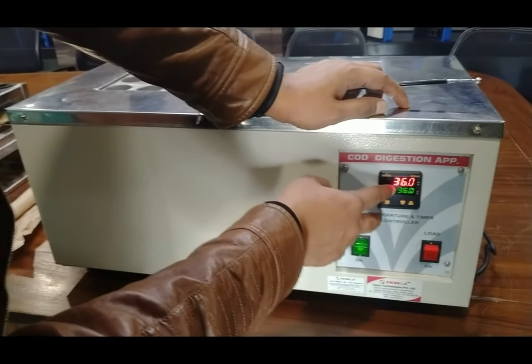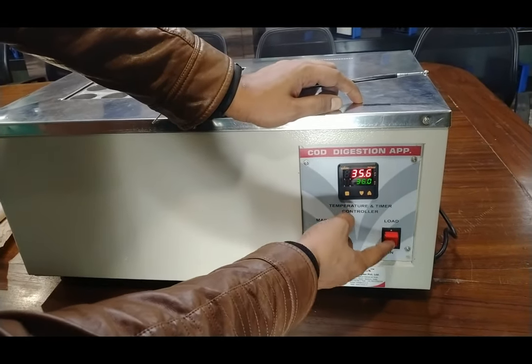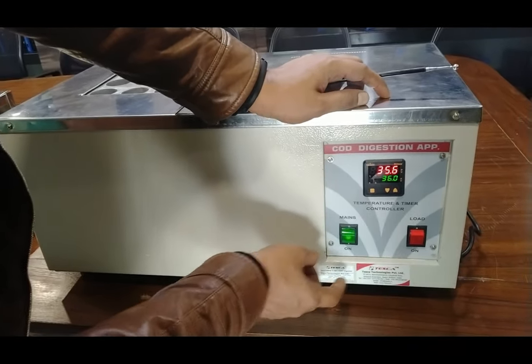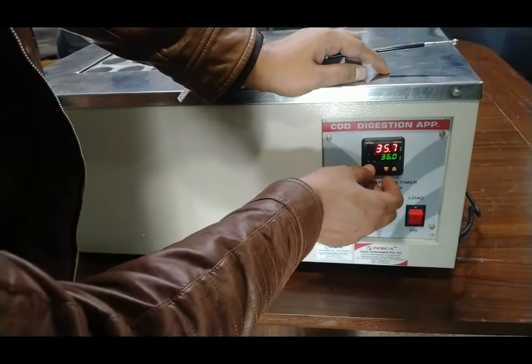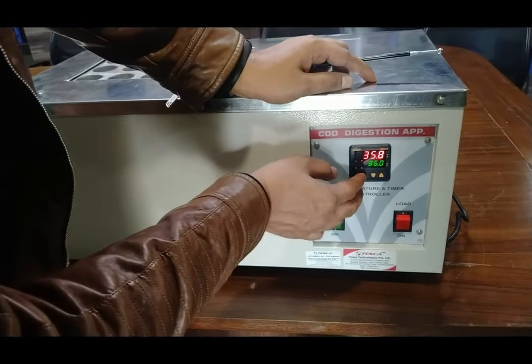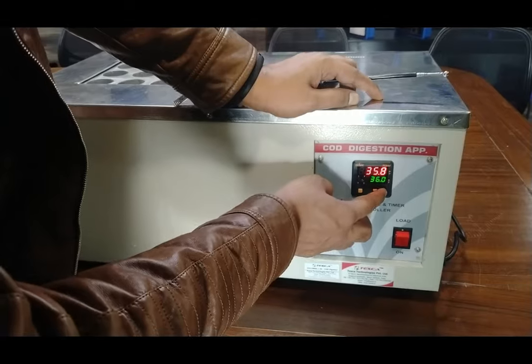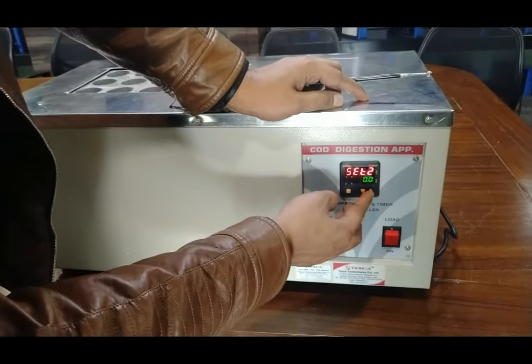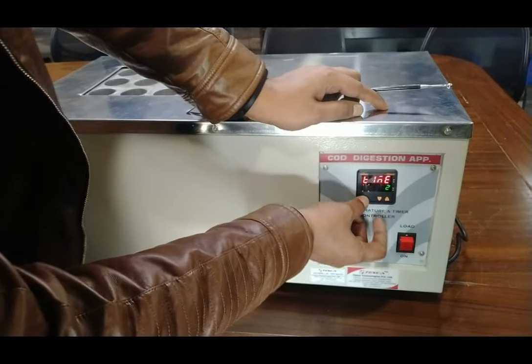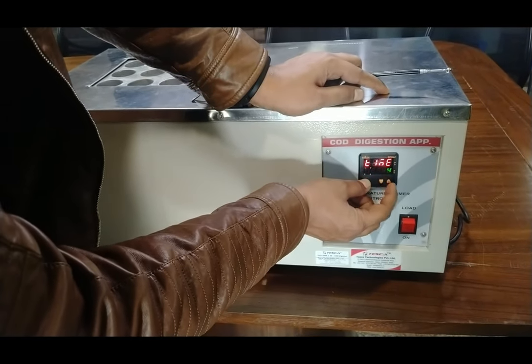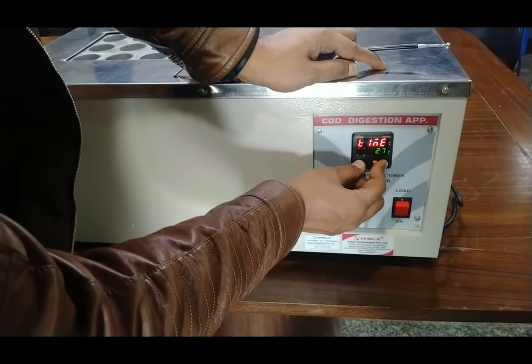Now we have reached nearby 36 degrees Celsius and the blinking of the load switch will take more time between blinks. You can also set the time — by pressing this set button you can change the time and operate the PID controller using the timer as well. Press the up key along with this key to set the time as per your need. It can digest the chemical for up to two hours.